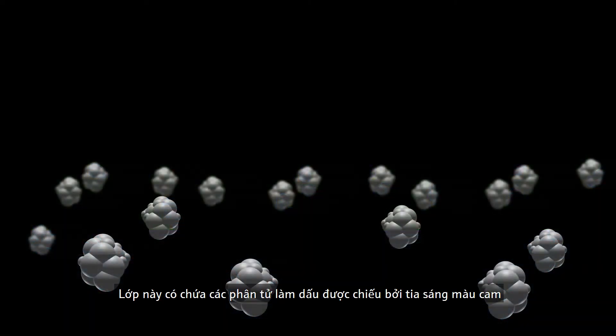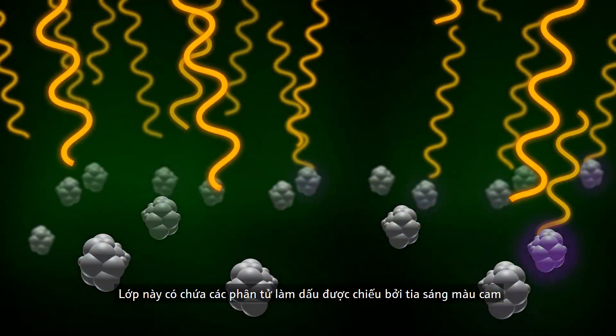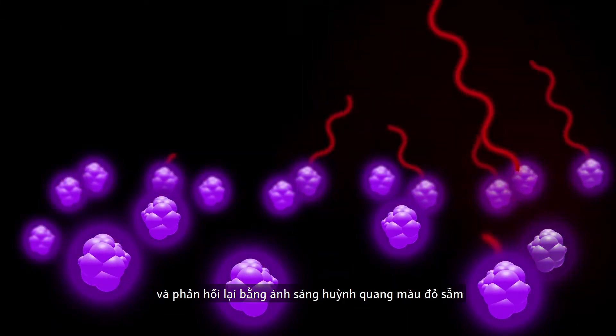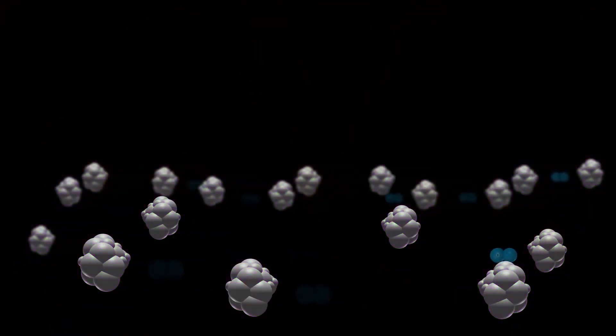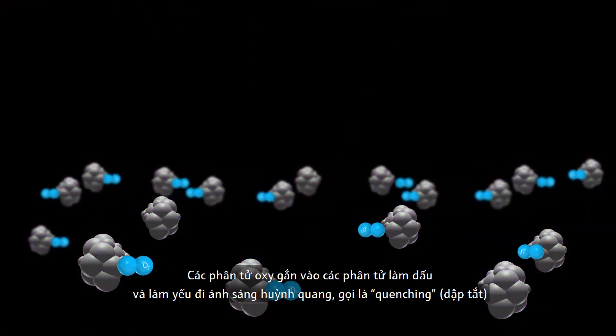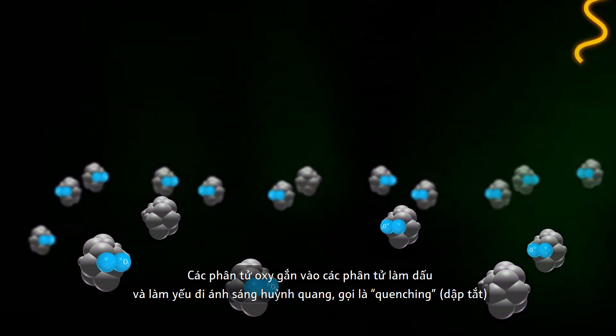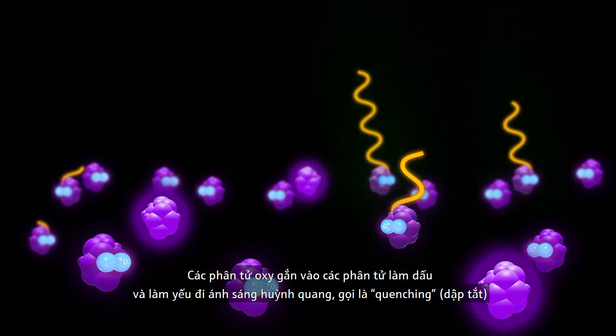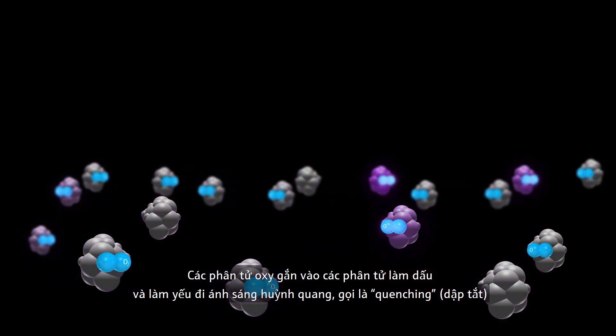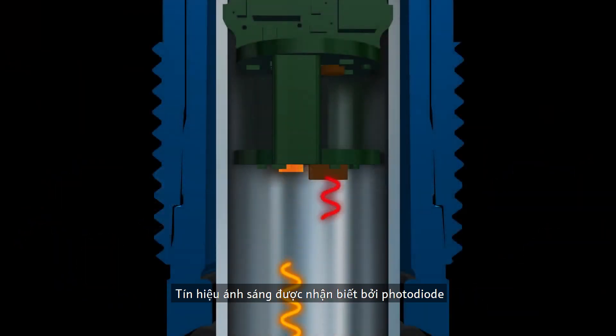The layer contains marker molecules that are excited by an orange light and respond with a dark red fluorescence light. Oxygen molecules attach to the marker molecules and attenuate the fluorescence light, which is called quenching. The light signal is detected by the photodiode, processed in the transmitter, and displayed in the required units.